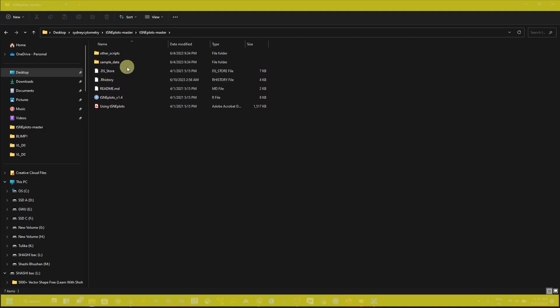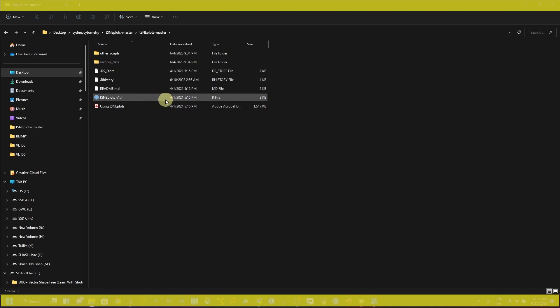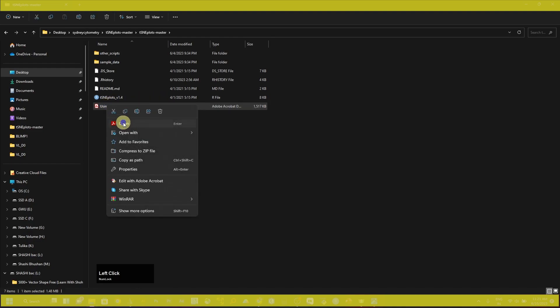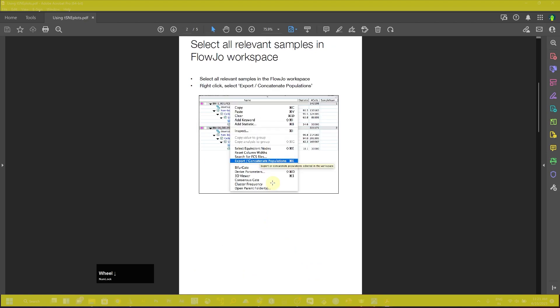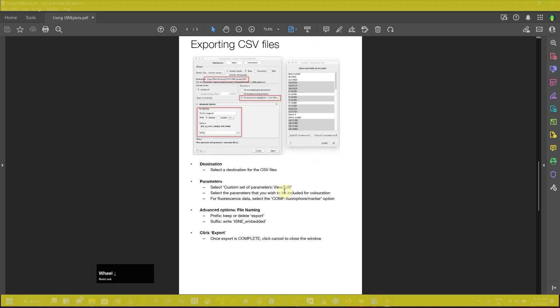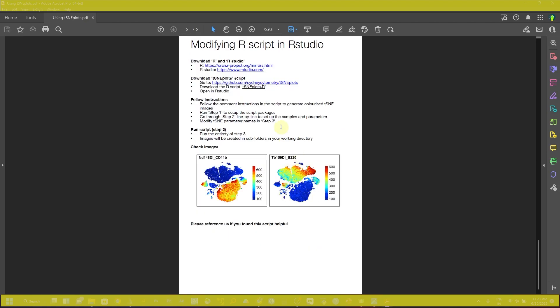They have provided many files and folders, but the two most important ones are the PDF and the R script. If you open the PDF file, you can see that this is provided by the Sydney Cytometry Core Facility in 2017. If you scroll down, you can see they have provided each step on how you can prepare and transform your t-SNE plot using the R script. They have mentioned please reference them if you found this script helpful.